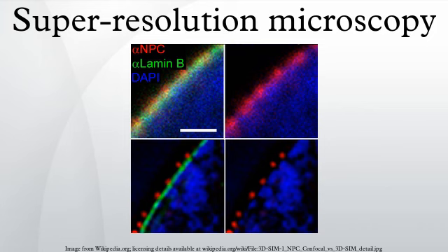True super-resolution techniques: near-field scanning optical microscope. Near-field scanning is also called NSOM. Probably the most conceptual way to break the diffraction barrier is to use a light source and/or a detector that is itself nanometer in scale. Diffraction as we know it is truly a far-field effect. The light from an aperture is the Fourier transform of the aperture in the far field, but in the near field, all of this is not necessarily the case.